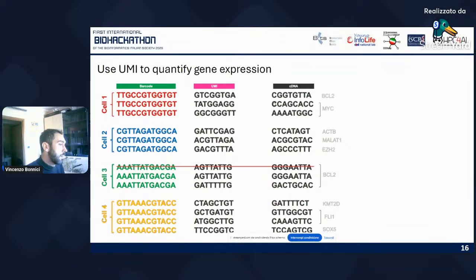And what is a common error is to consider the whole transcriptome, for example, of the human genome. Okay, this is not good, because you should have a wide list of the genes that should be in your analysis, and that you are going to sequence with your experiment.